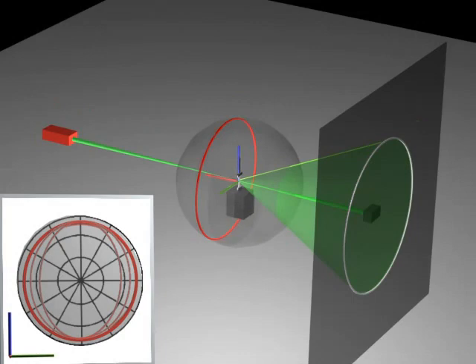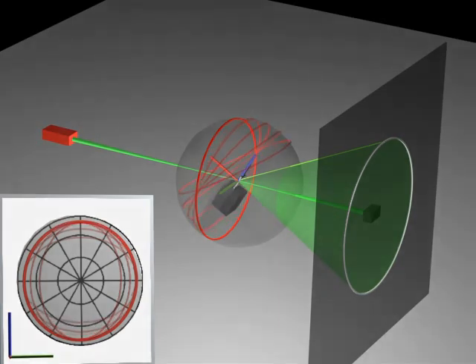Rotation about the specimen transverse direction with associated diffraction exposures produces rings of data oriented orthogonally to the previous example. The area detector reduces the number of sample orientations needed to fill the pole figure.